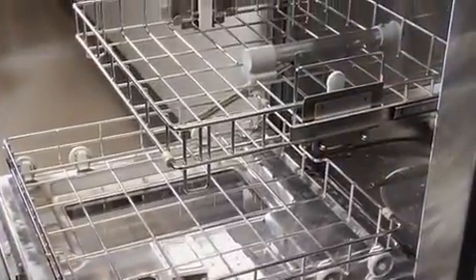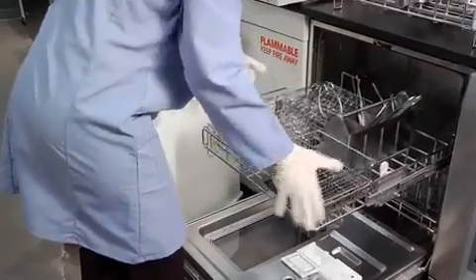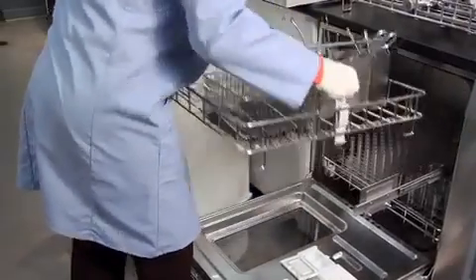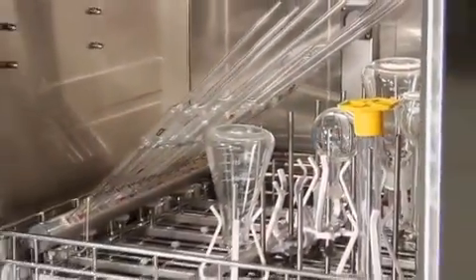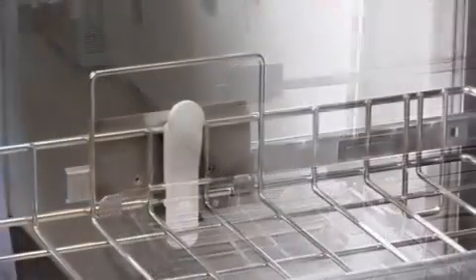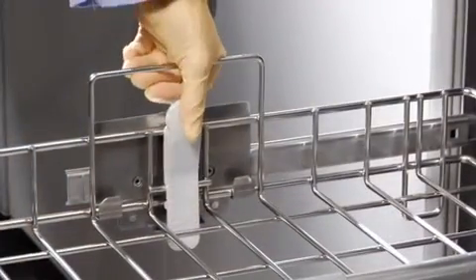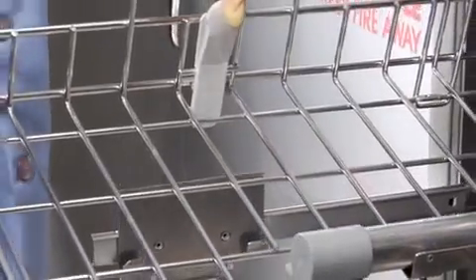The Steam Scrubber comes with standard upper and lower racks. The upper rack may be easily removed to facilitate loading the rack outside the washer or to allow very tall glassware to be loaded and washed on the lower rack. To remove the upper rack, slide it all the way out of the washer, then grasp each side placing thumbs on the two release buttons, press the buttons, and lift the rack straight upward.